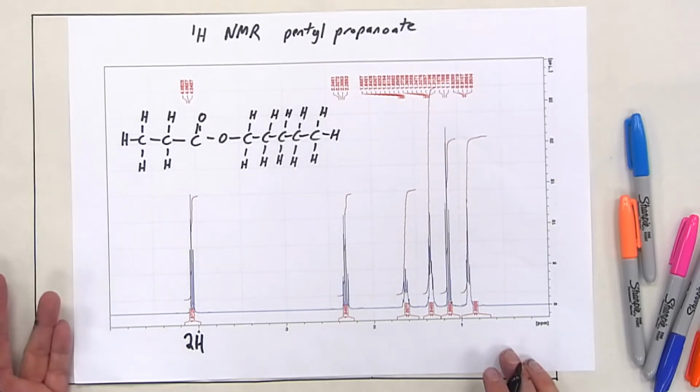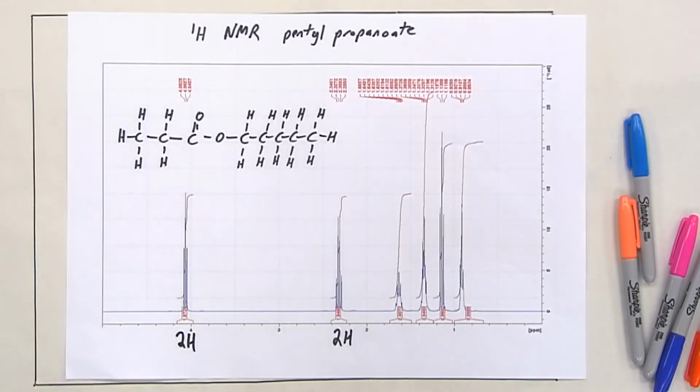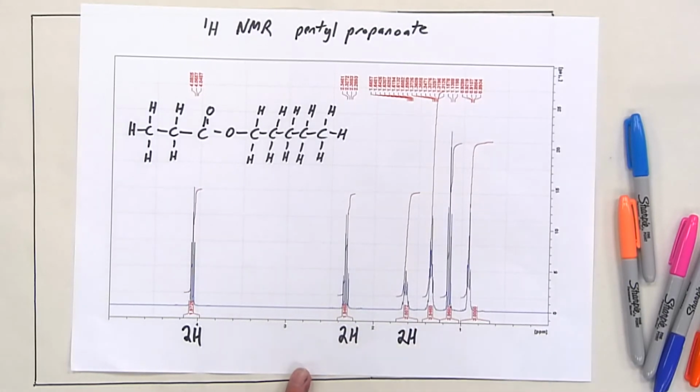Which is fine, it's a CH2, we've already discussed this. This one also has approximately 2 hydrogens contributing to it, so again, that's a CH2. The one a bit further down, towards 0, the next one along, also has 2 hydrogens, so that will be another CH2.